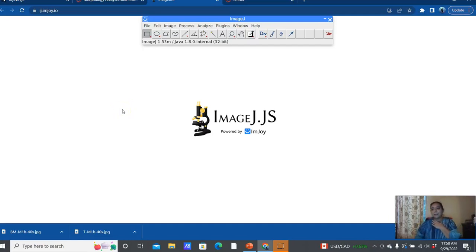Guys, so I just wanted to give you another ImageJ tutorial, kind of a quick version that walked you through the different types of observations that you can make using the ImageJ software. I'm going to be using the browser version for this software, so this is just the link that I've provided you before, which allows you to use the ImageJ software without downloading it onto your device.